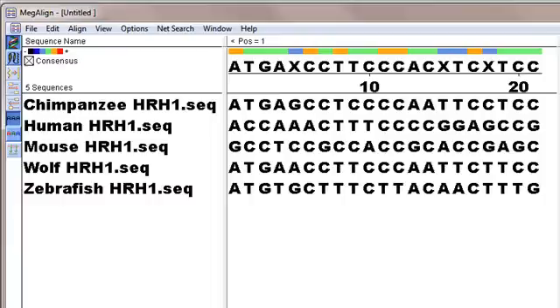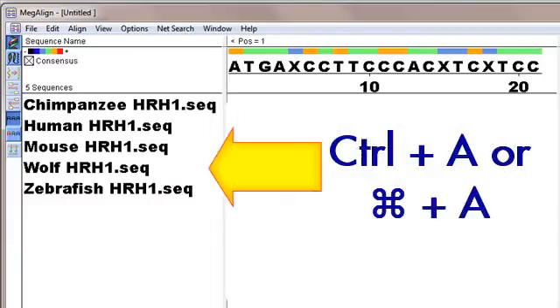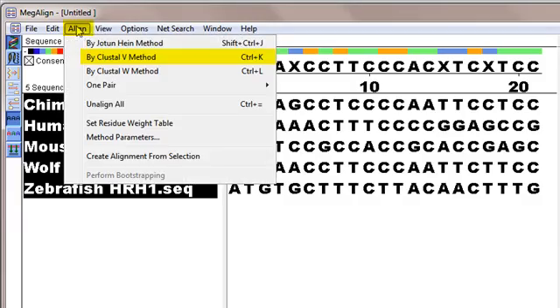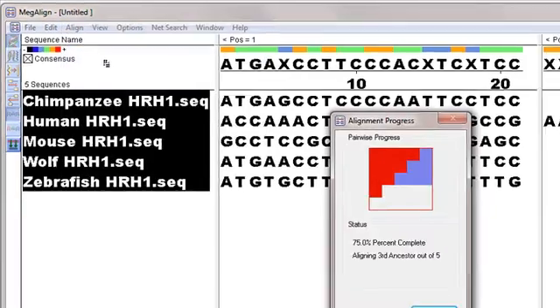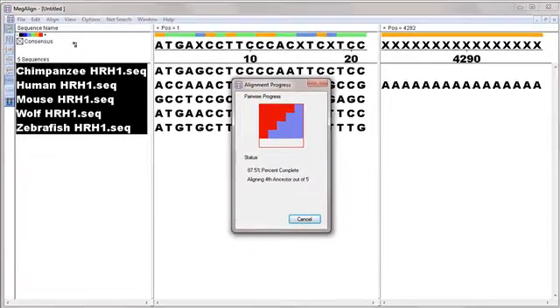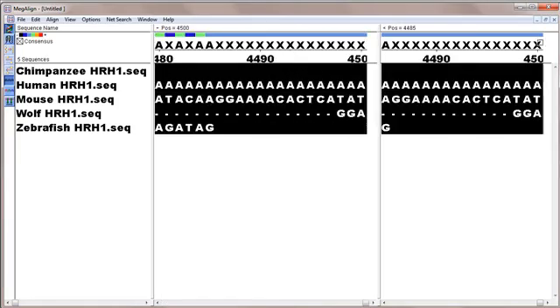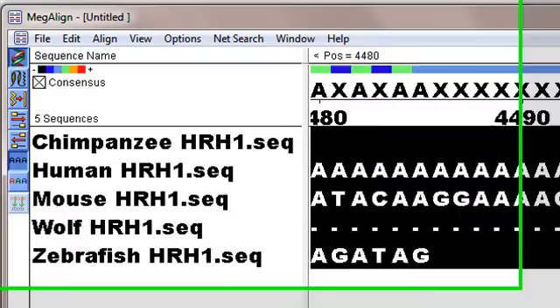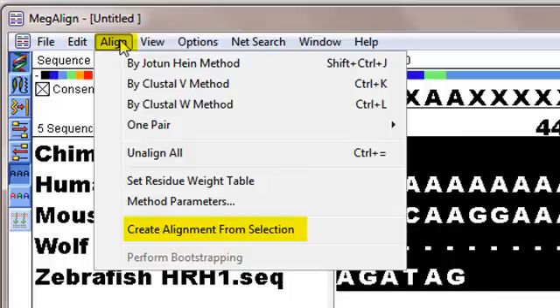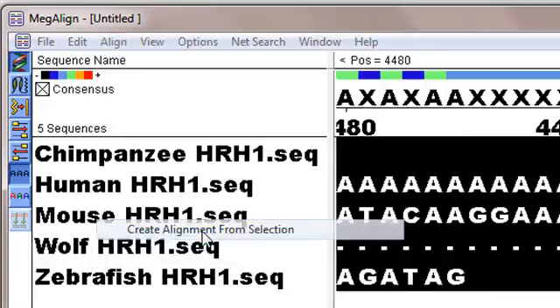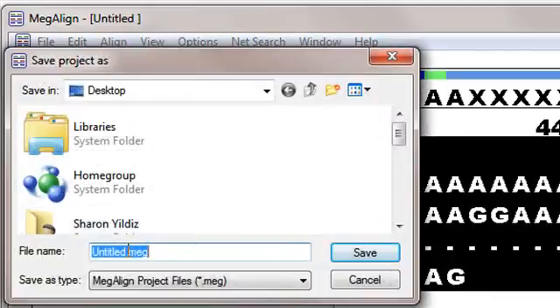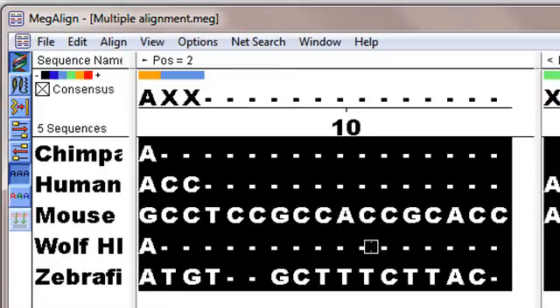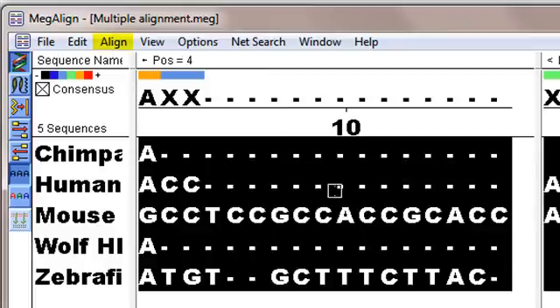First, select all of the sequences using Control-A or Command-A, then use Clustal-V for the initial alignment. Next, select the entire consensus by dragging, and set the ends of the Clustal-V aligned sequences using the Align Create Alignment from Selection command. Save the project with the desired title, and generate the final alignment from this new project using Clustal-W set to Slow Accurate.